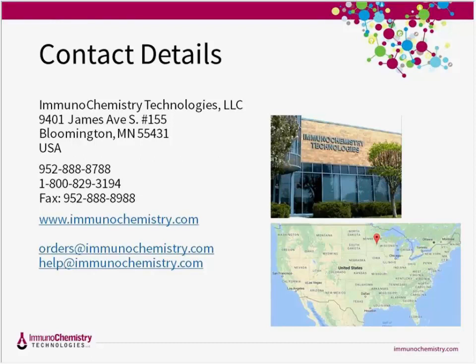It can be used in two different ways. First, you have the option to add the FLICA directly to the overlay media, and then you would complete your FLICA staining and wash steps while the cells are still adherent, in which case you would trypsinize the cells afterwards. Otherwise, you can trypsinize the cells, neutralize or deactivate the trypsin, and then you would carry out the FLICA staining and wash steps afterwards on the trypsinized cells.